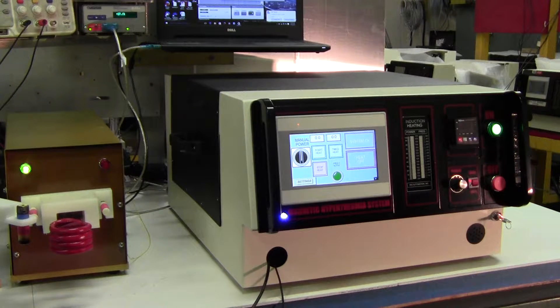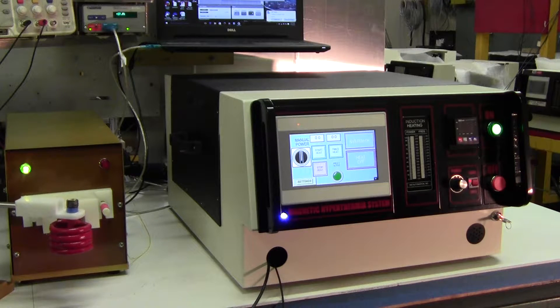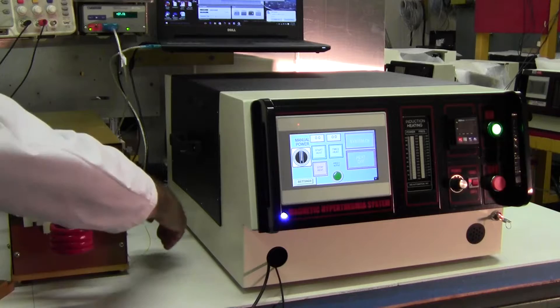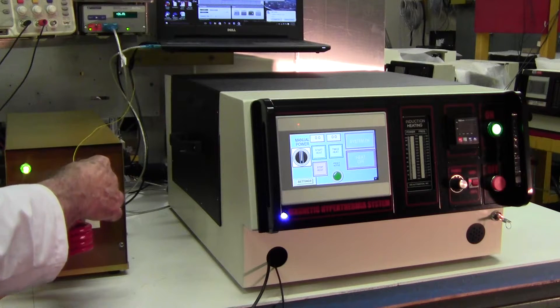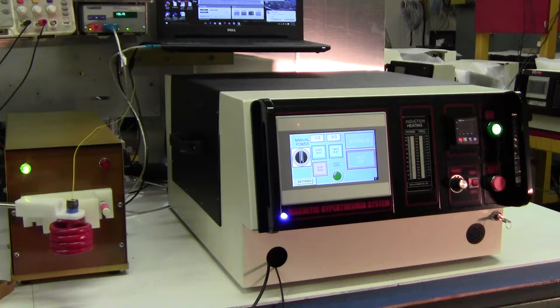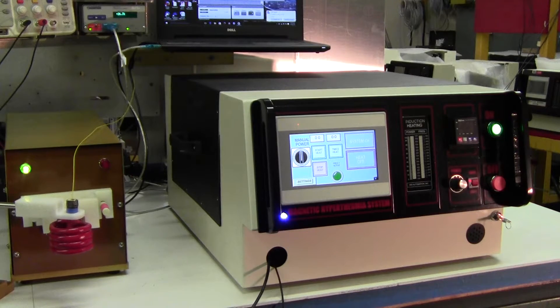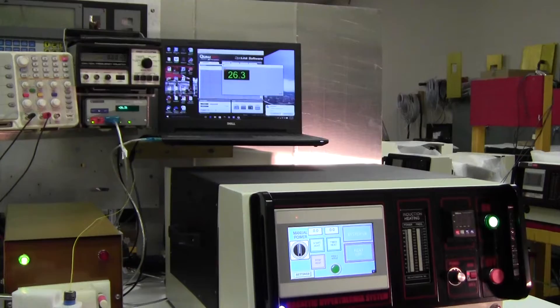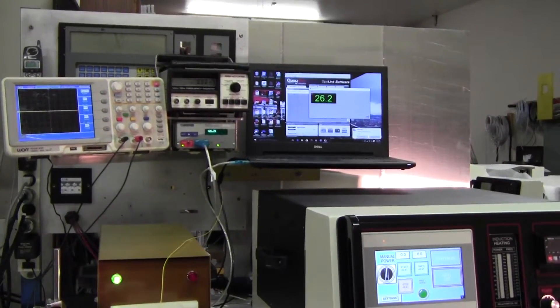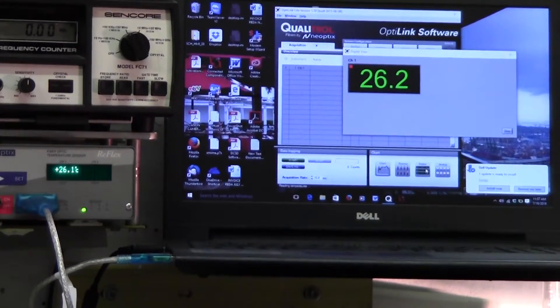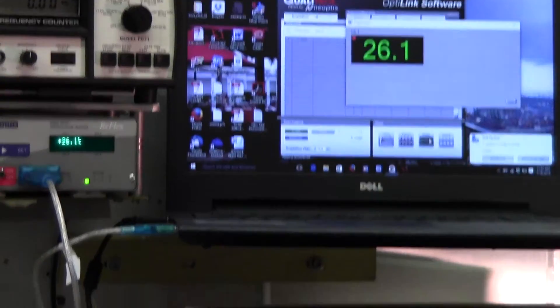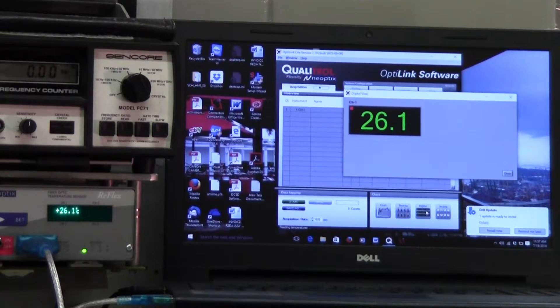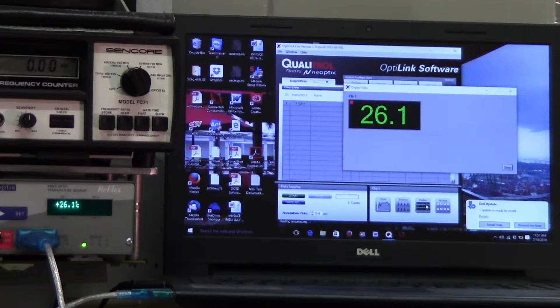Now I'll put some nanoparticles inside the heating coil, and I will stick a fiber optic temperature sensor cable inside the nanoparticles. And these are actual nanoparticles, they're not just metal filings. And if you look above, we'll zoom in. That's the current temperature shown in digital format.